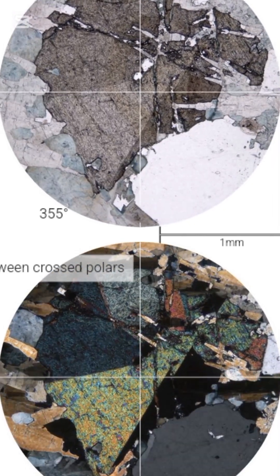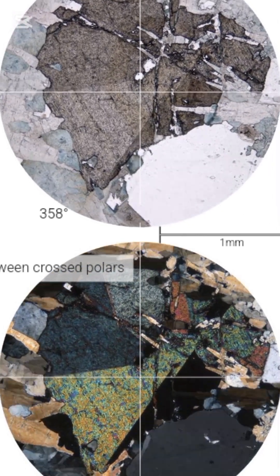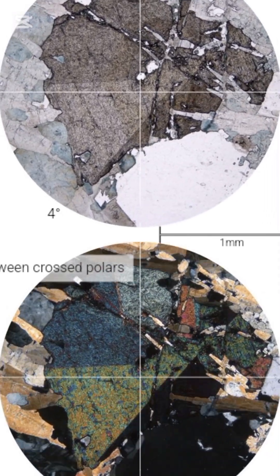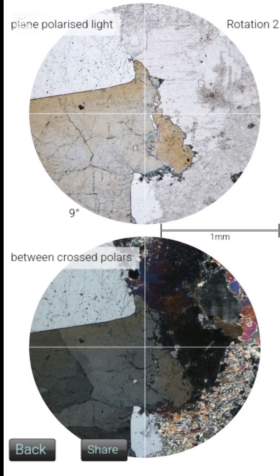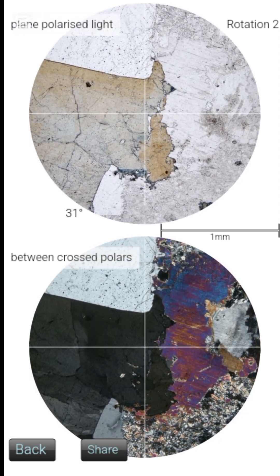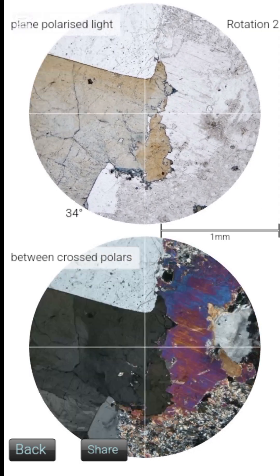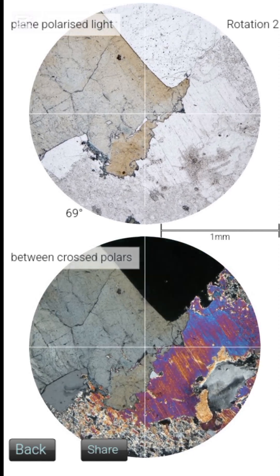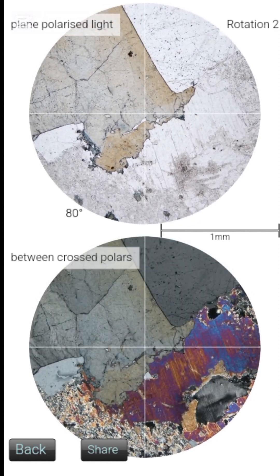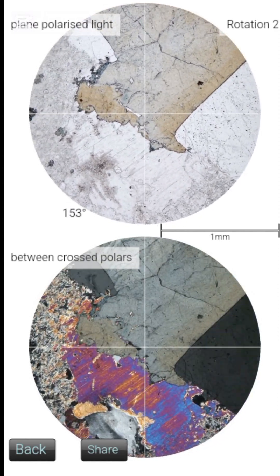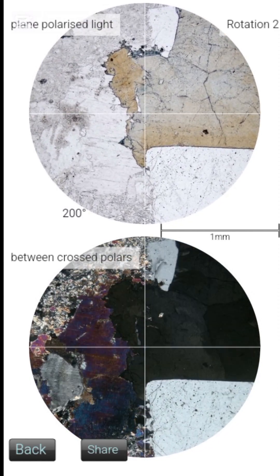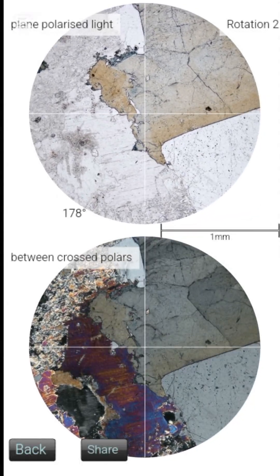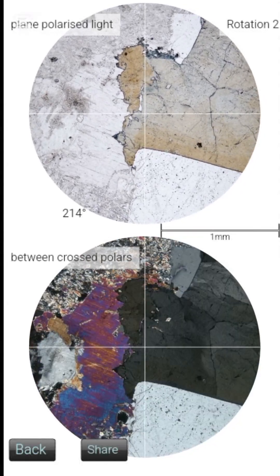The vein also contains tin oxide, which is cassiterite, distinguished by its higher relief and dark brown color. Although unlike many minerals, it is not opaque.